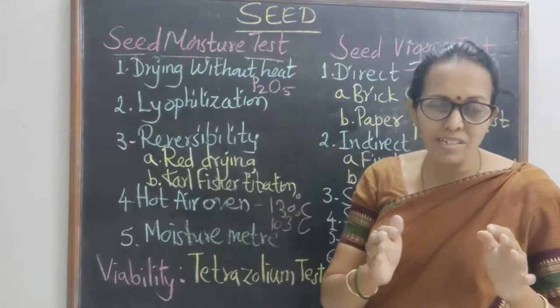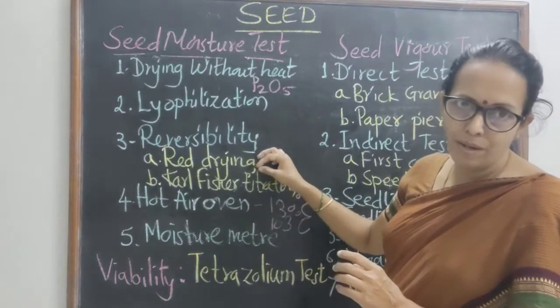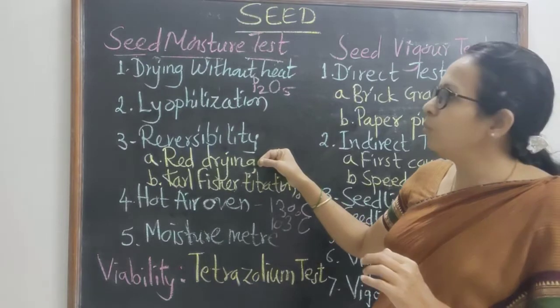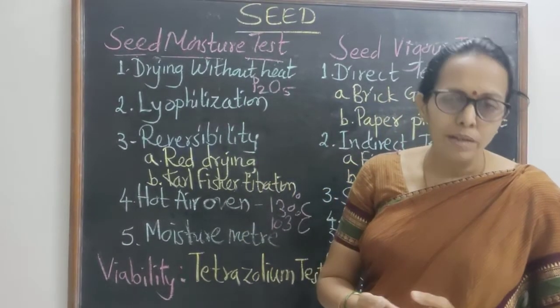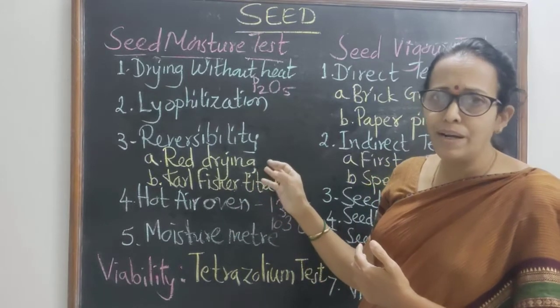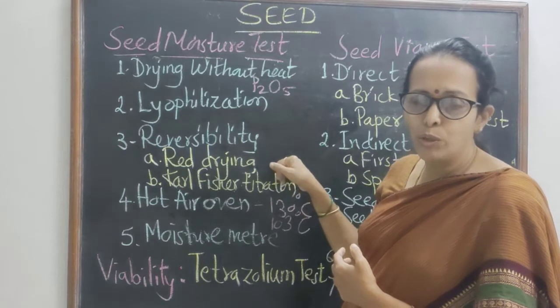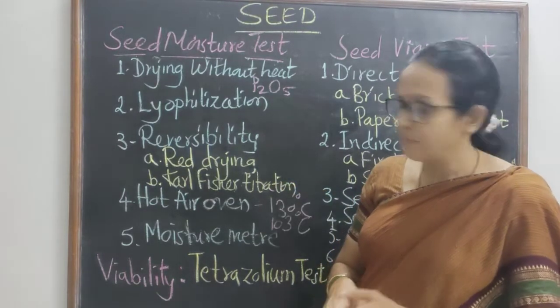Temperature and duration of drying are considered here, so that it can be made clear whether the weight loss is due to removal of moisture or due to decomposition. So it is also a useful method, or what we call an accurate method.